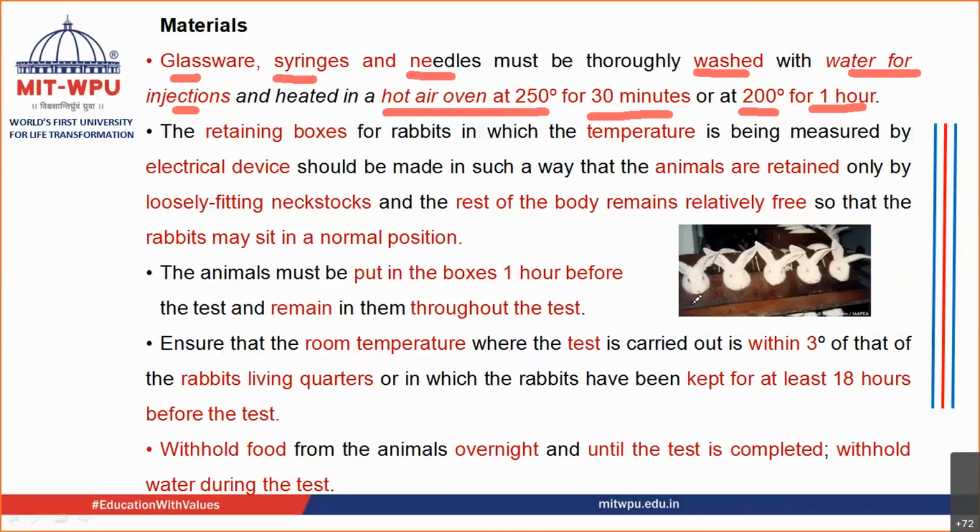These are the retaining boxes in which you are going to keep the animals, and in which you are going to measure the temperature. It can be measured with the help of thermometers, thermistors, or any other electrical devices.